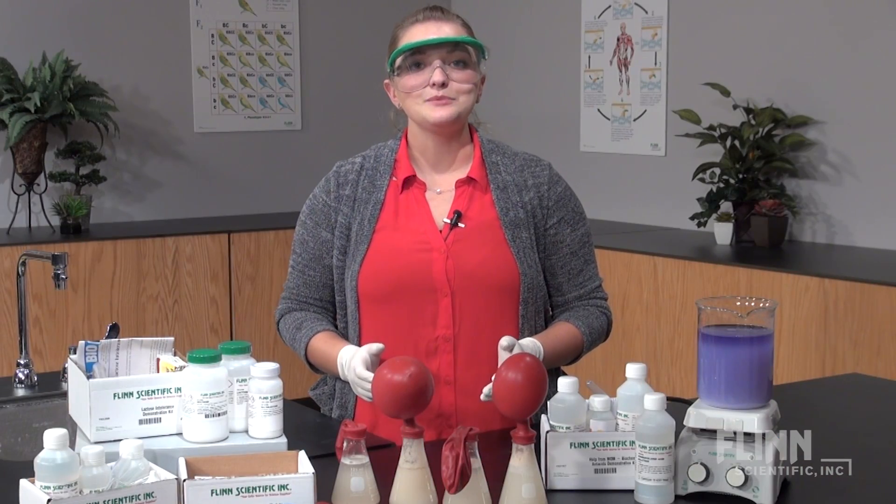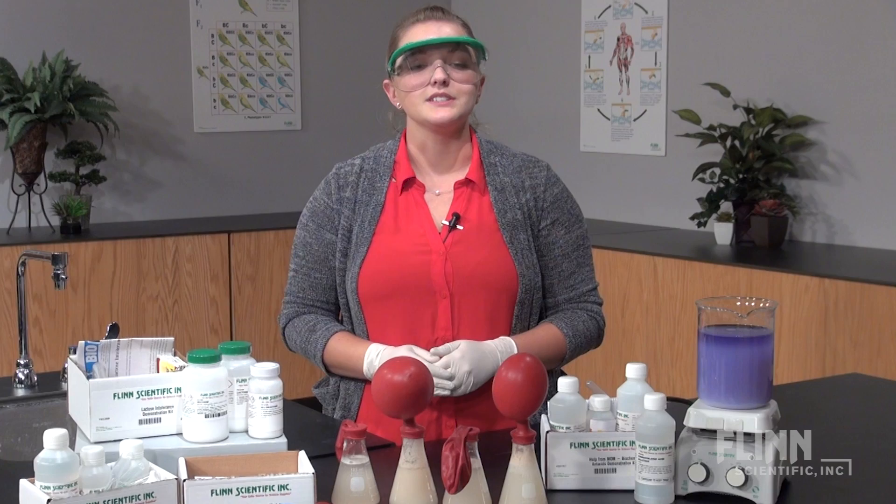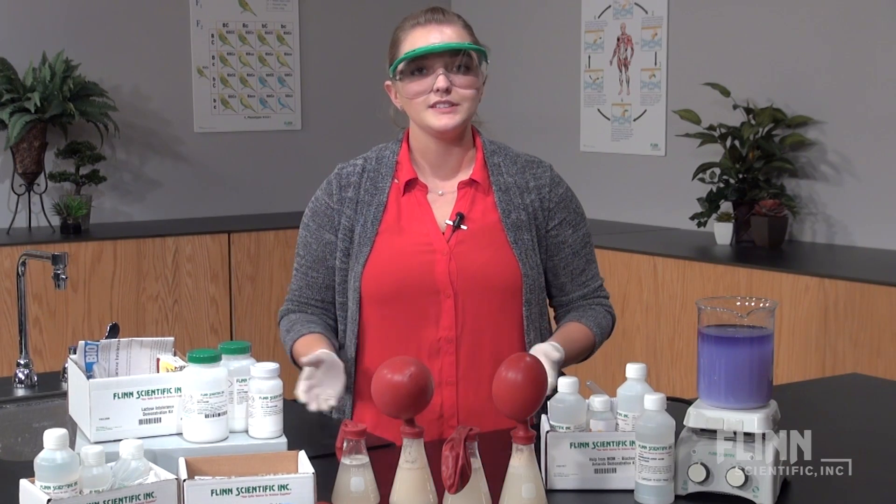In science, sometimes seeing really is believing, inspiring. Inspire your students and solidify their understanding with Flynn's demonstration kits.